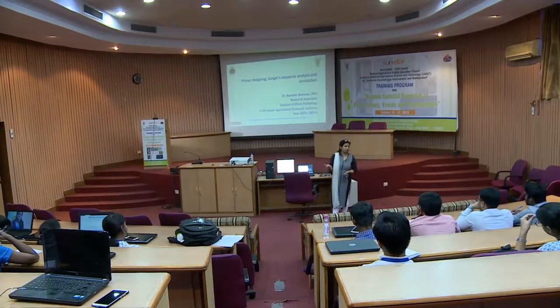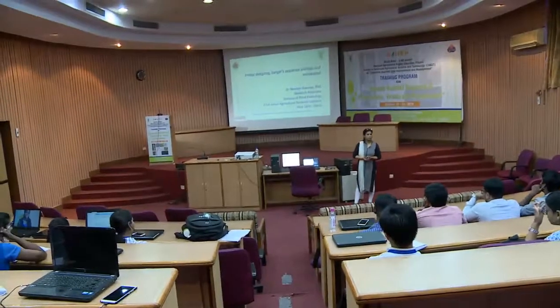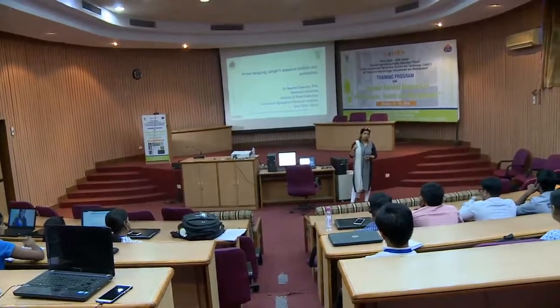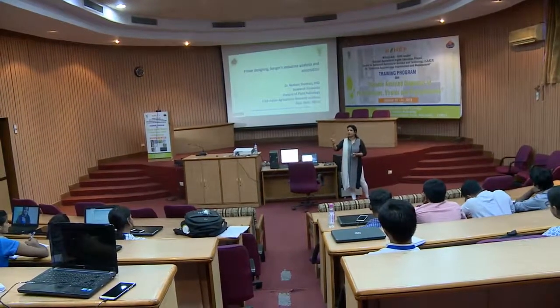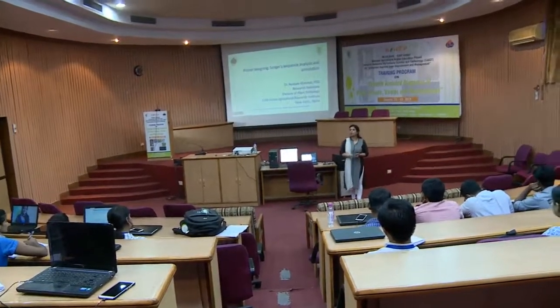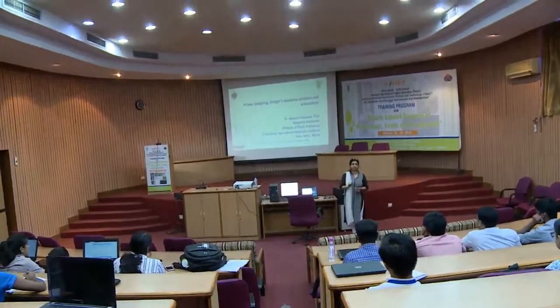So, the binding site of the primer from the forward up to the reverse should be 800 base pair. Okay. The software which I will be telling you right now is the Primer3Plus software. So you can pick the sequence if you have a net connection, or you can open Primer3Plus, please open it and maybe you can try it simultaneously also.